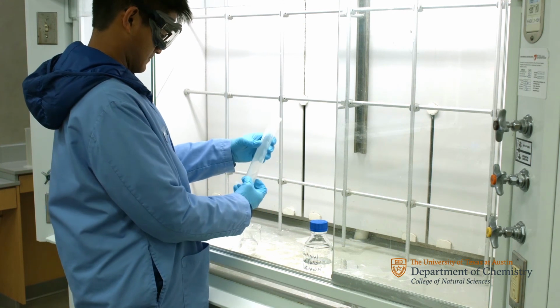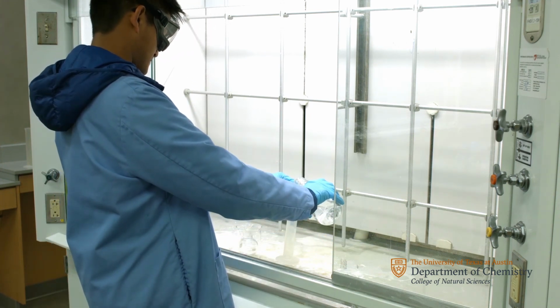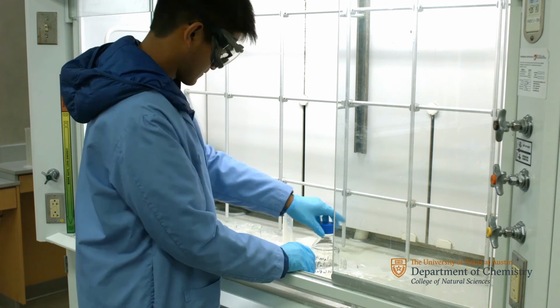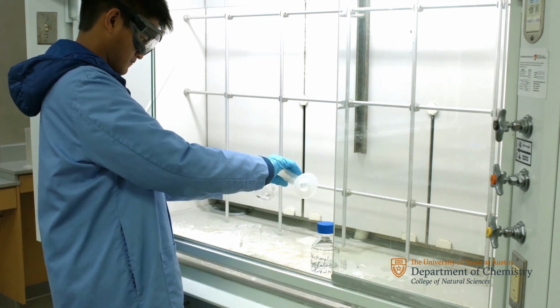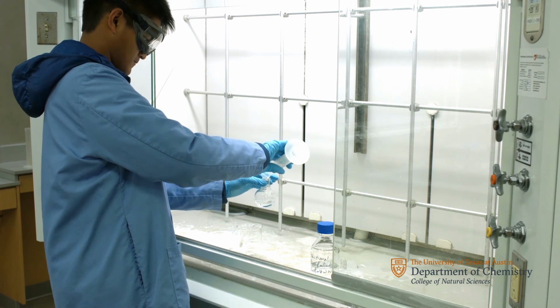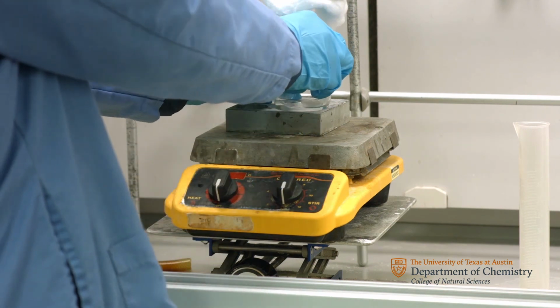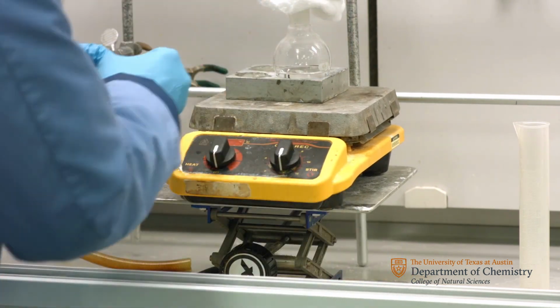Once your TA has given you the OK, go to the sample hood and pour out 30 milliliters of the unknown into your 100 milliliter graduated cylinder. Then, pour it into your 100 milliliter round bottom flask. You can use a large beaker to transfer the flask to and from your own hood. Place the flask back onto the hot plate and re-secure it to the column. Make sure to put a Keck clamp on it this time.